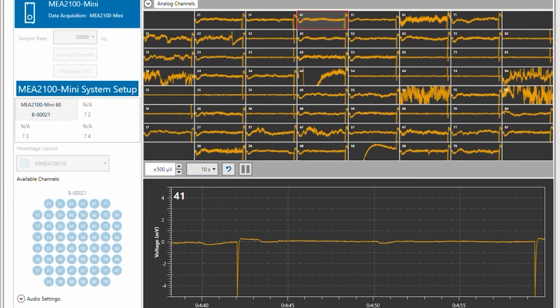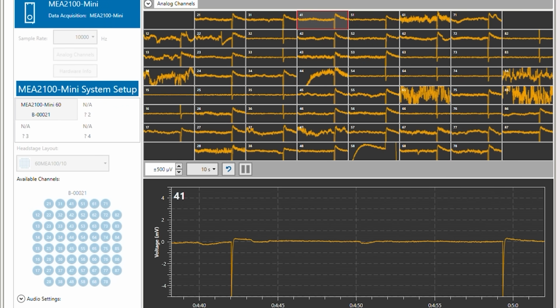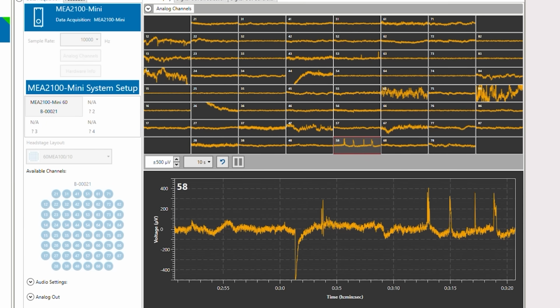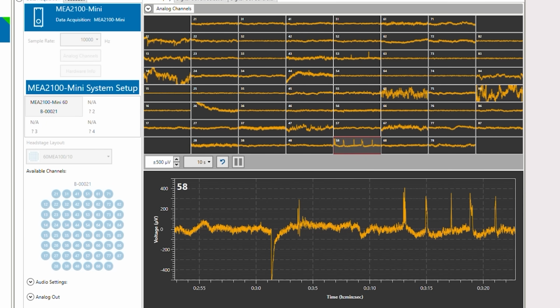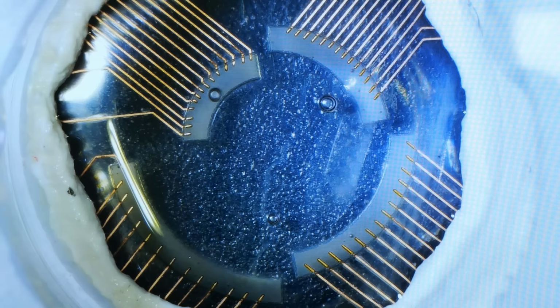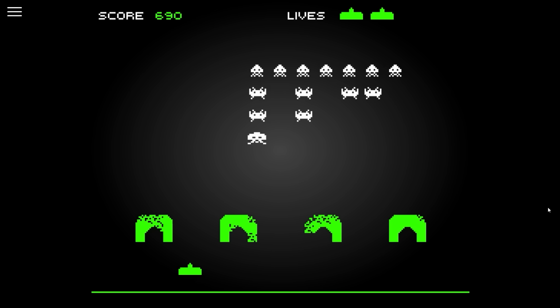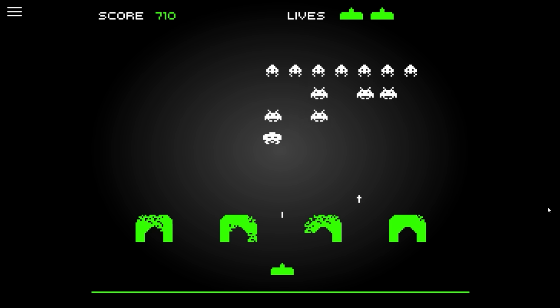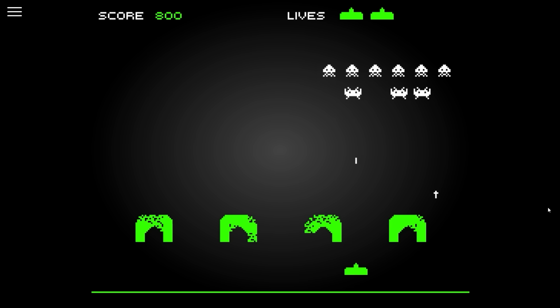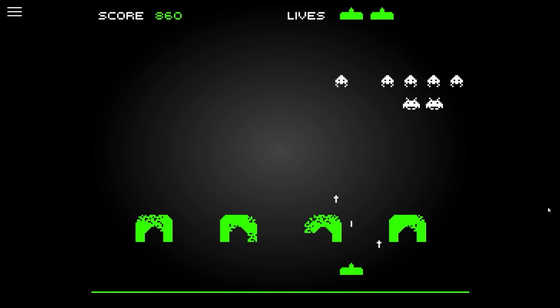behavior. As you get further away from the stimulator, we see a pulse, but it's inverted. I wonder if what we're seeing is Jerry recoiling away from where the pulse originates and pushing mass to further away areas. Honestly, seeing this immediately made me think that we could train Jerry to play video games just like the neurons. Sure, it's going to need a different layout of the array and probably a different control scheme, but Jerry is so electrically active that with the right setup, I think we could build a Jerry-based control loop. But, I mean, that's going to have to be for another day.